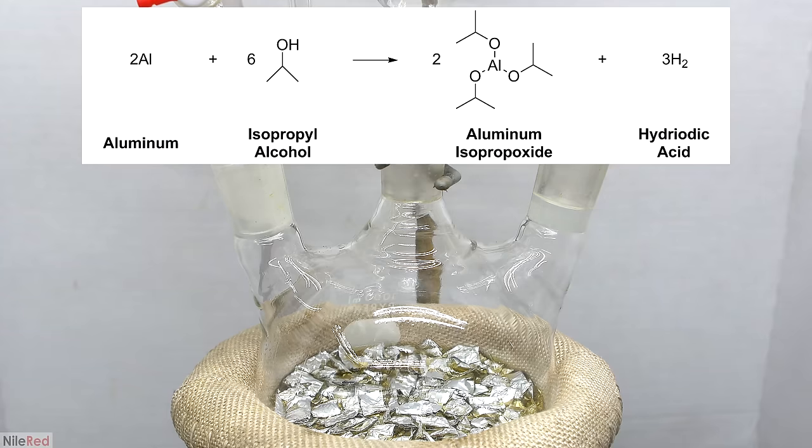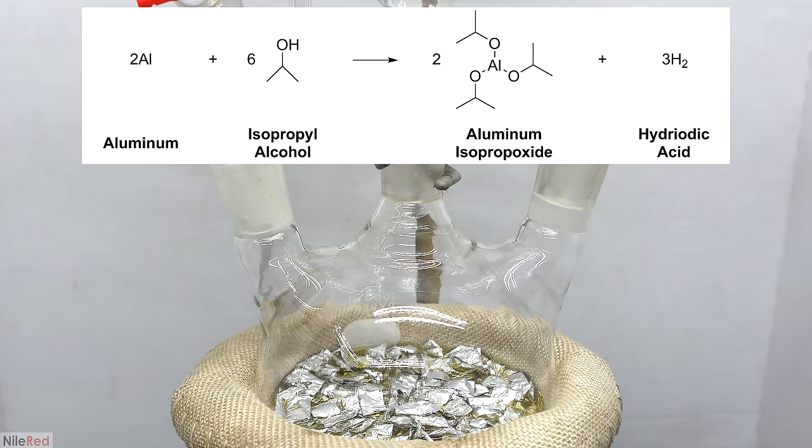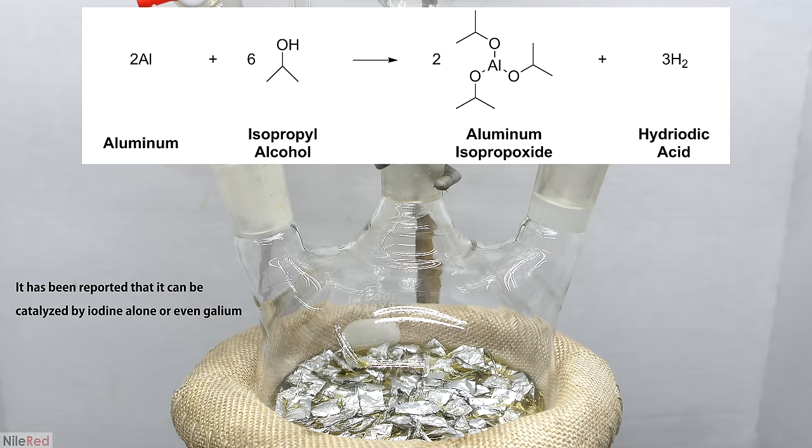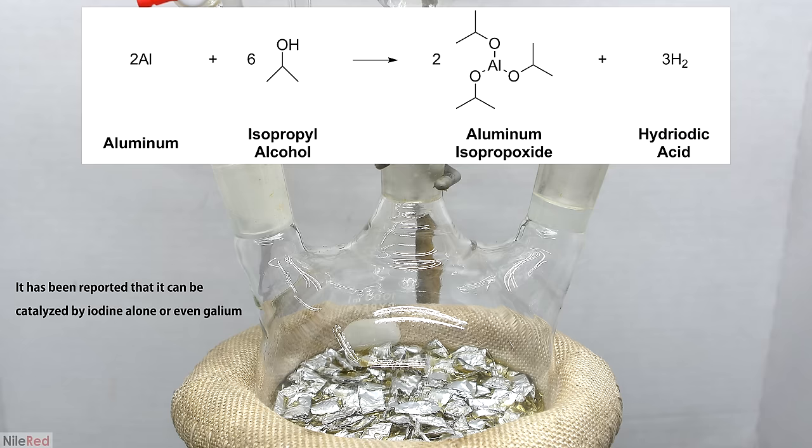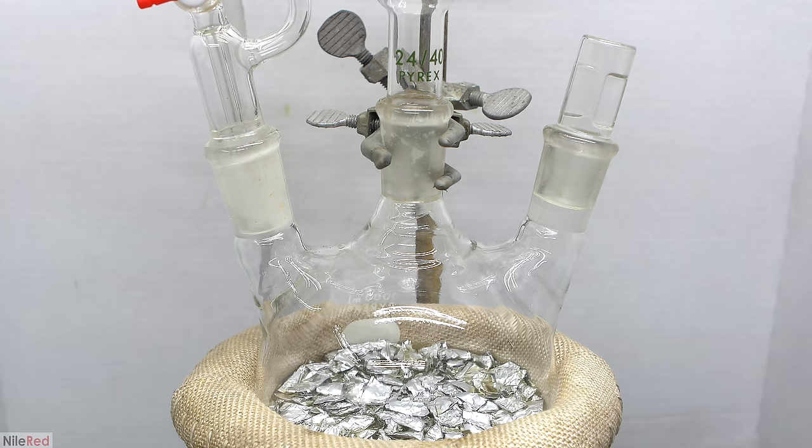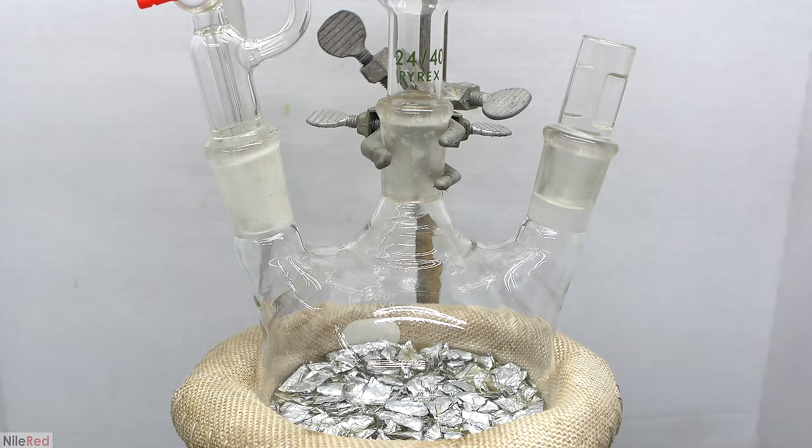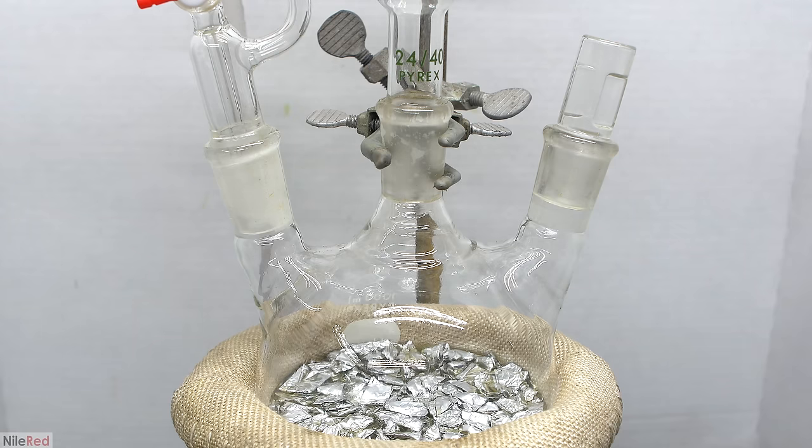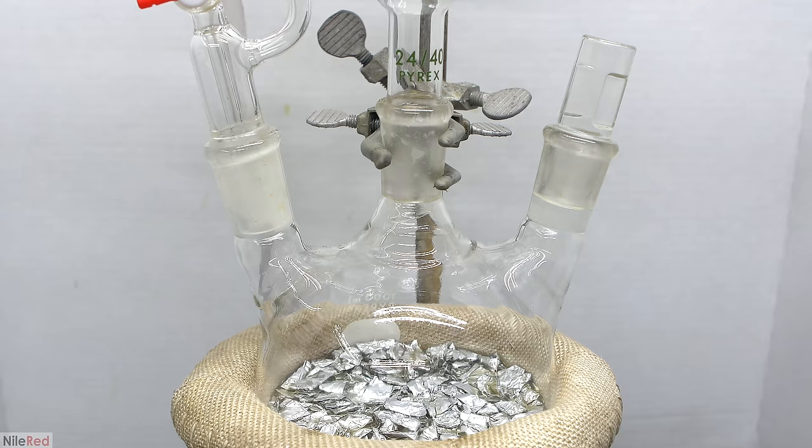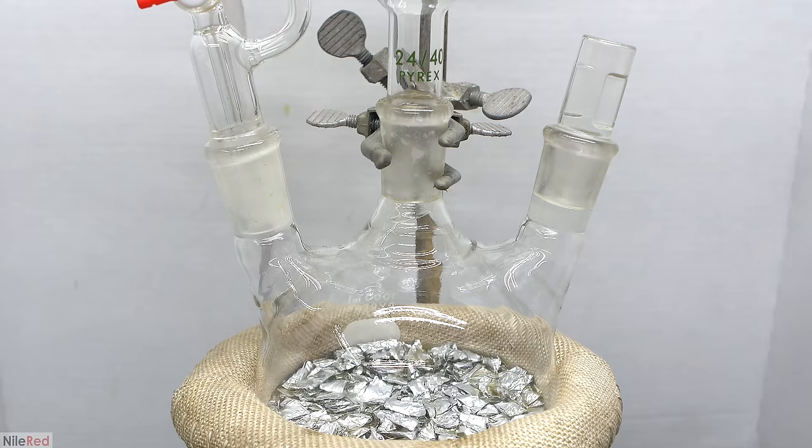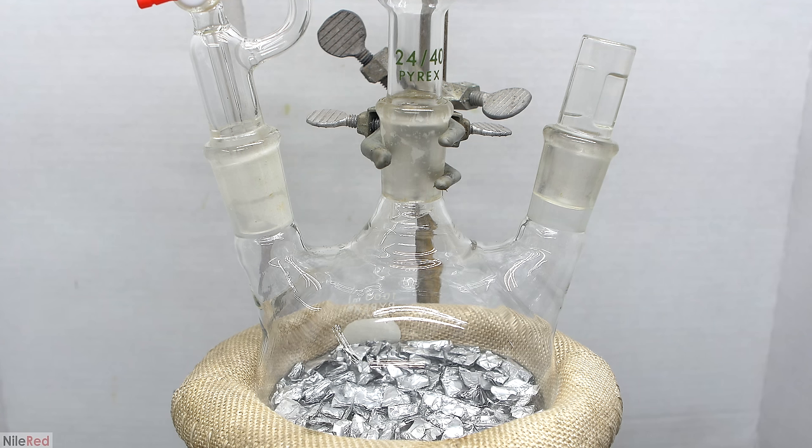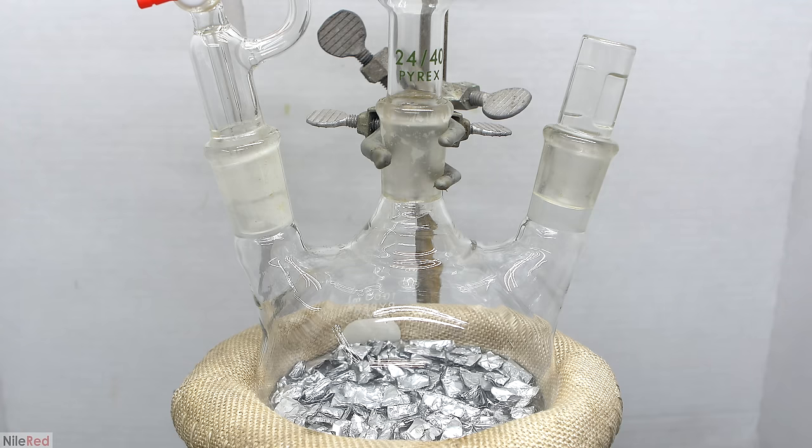The reaction we're carrying out is between the aluminum and isopropyl alcohol to produce aluminum isopropoxide. The reaction is catalyzed by both mercuric chloride and iodine. When fresh aluminum metal is exposed to air, it quickly reacts to form an oxide layer on the surface. This oxide layer acts as a physical barrier and prevents the metal from undergoing further oxidation. With this oxide layer, our aluminum is pretty inert, and if we want things to react, we need to get through this protective barrier.